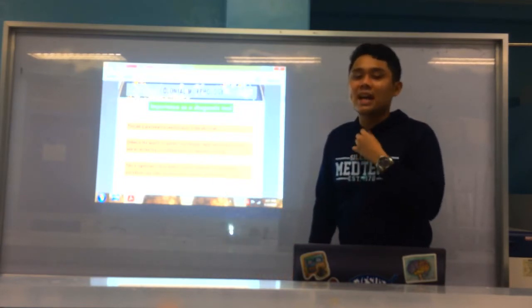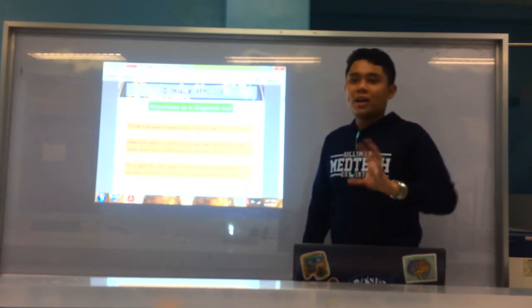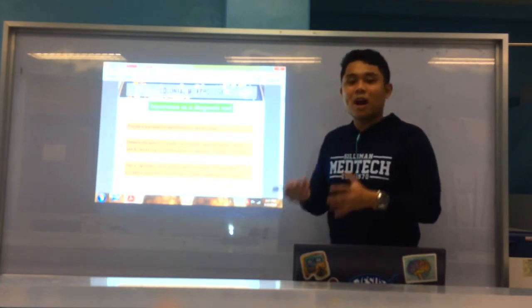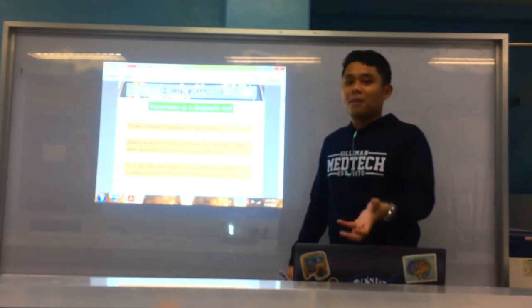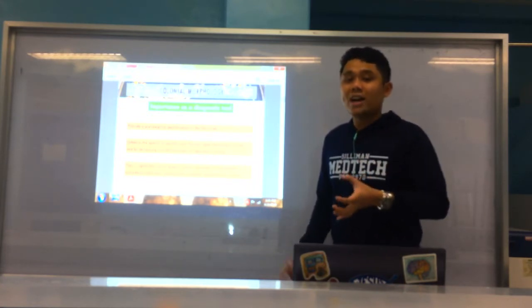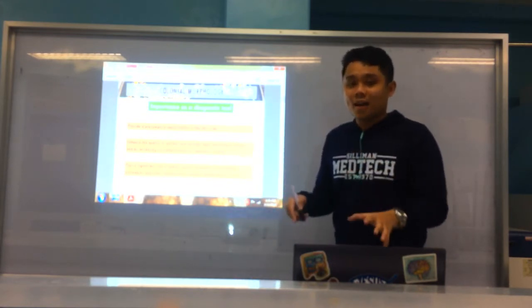Again, I emphasize that colonial morphology cannot be used for definite identification of our bacteria based on colonial morphology alone. It can only give you a presumptive identification, a glimpse or initial information as to the possible identity. But we don't stop there.